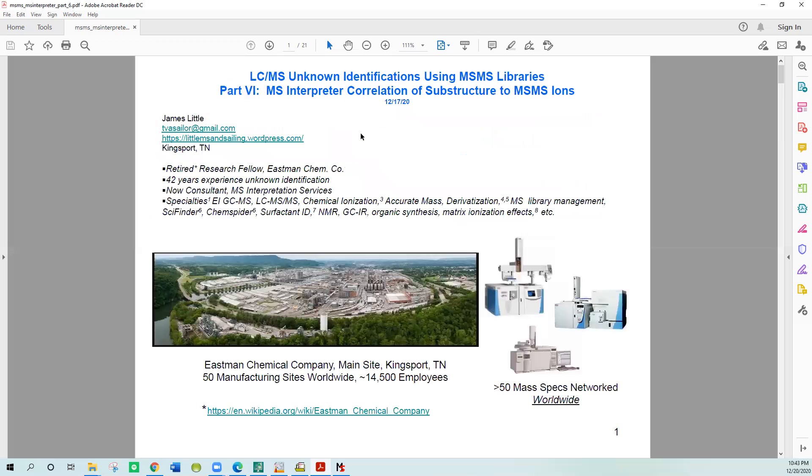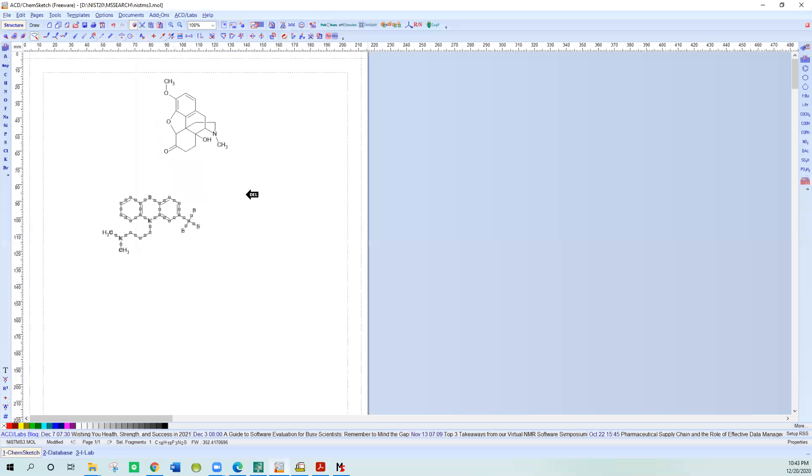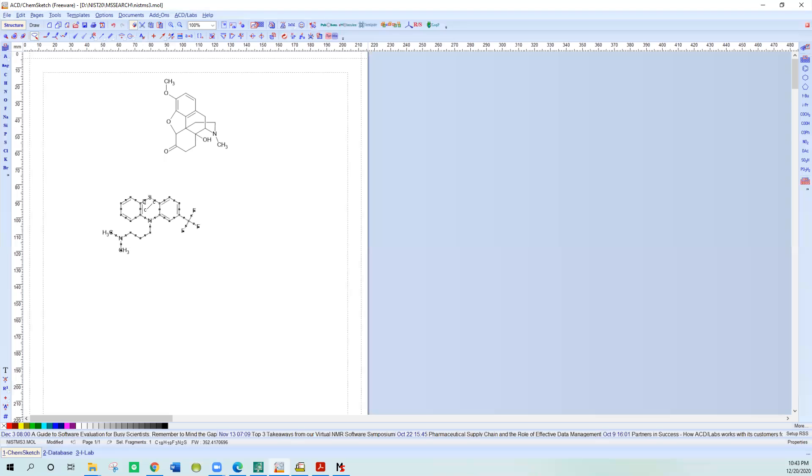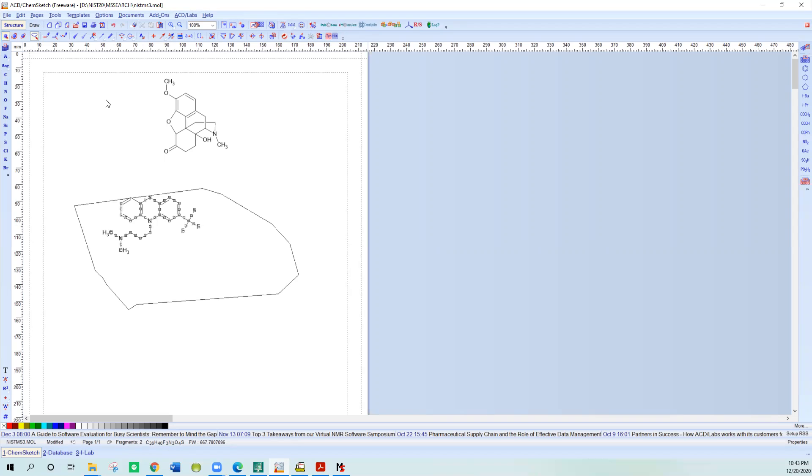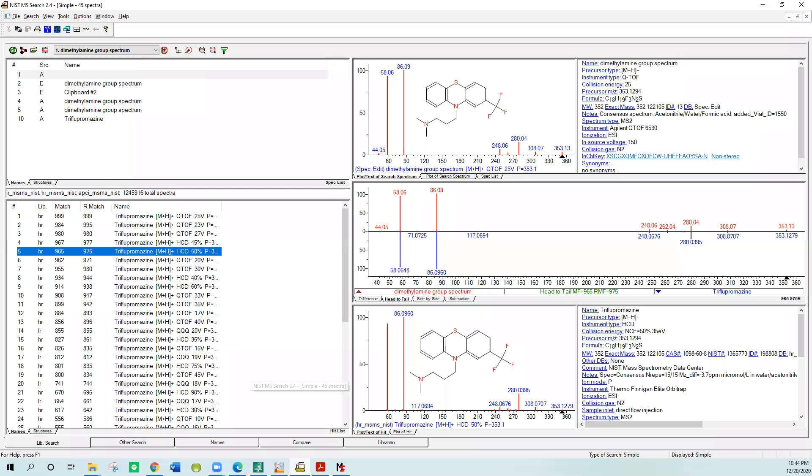The first thing one needs to do is draw a structure because we have to correlate it with our spectrum. I've drawn two structures here. I need to select the one I want, circle it, and in this program you have to choose it and say edit, copy. When you copy it, it puts it into the Windows clipboard and enables one to put it into the NIST software. So we'll open up the search software.